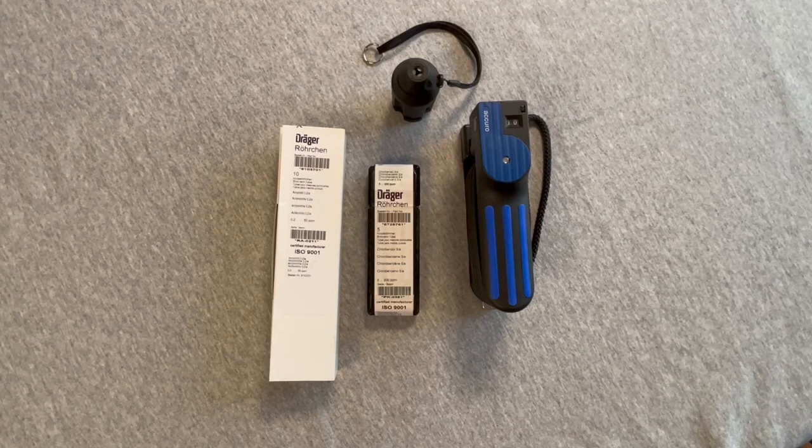Two-tube systems may be packaged with the pre-tube and the indication tube connected at the factory for a total of 10 measurements, as in the case of the acrylonitrile 0.2/A tube.